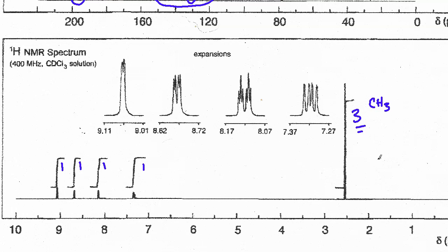Now, we know that we're proposing the acetyl group, right? So this should be coming together at this point. This next to a carbonyl should show up somewhere probably in the neighborhood of 2 to 2.5, and that's exactly what it does. It also should not have any neighbors if it's attached to the ring as far as hydrogens are concerned. And so when we take a look at this, it should be a singlet, which it is. It's just one signal. We don't have any type of splitting.